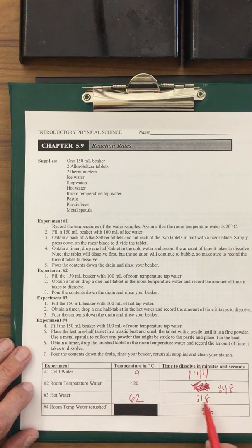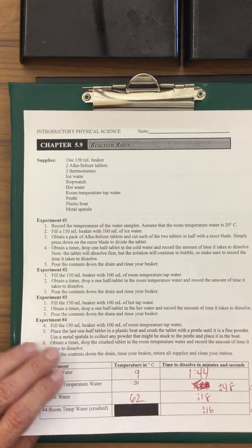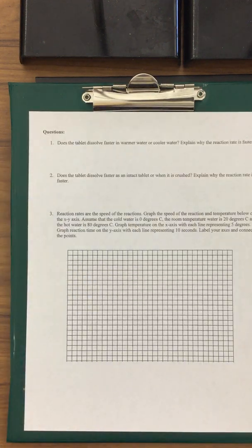And when we took the room temperature tablet and crushed it, we're comparing these two right here. If we crush this tablet into smaller pieces, if you notice, it dissolves about 3 times more quickly because there's more surface to dissolve, because it's been crushed into those smaller pieces. So let's take a look at the questions.